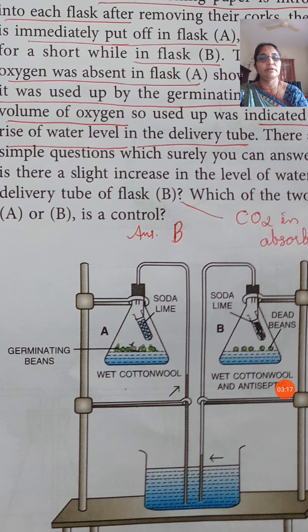Oxygen and carbon dioxide present in the flask are consumed. Oxygen is consumed by the germinating seeds and the carbon dioxide is absorbed by the soda lime. So, a vacuum is created in flask A. A considerable rise in the water level of the delivery tube can be seen.